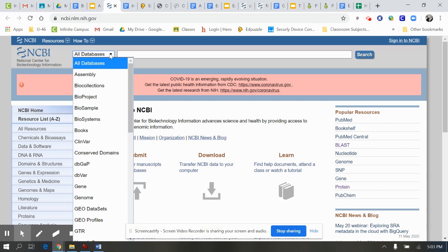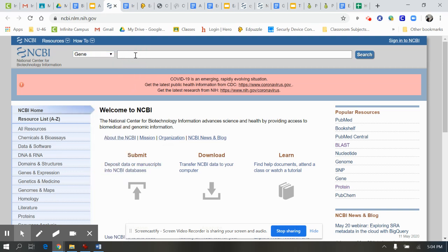And here is where you have to start clicking very specific things. In the instruction, it says use the database. It says gene. It tells you to type in cytochrome C plus your animal name. And again, scientific name works great. I can use my common name because I know what I'm looking for. But when I was searching some of your animals, it was a lot of stuff happening. So for instance, the tiger had a tiger mosquito, a tiger eel, and lots of, again, very technical things. So I want you to get there in the simplest way possible. So I'm going to now paste my penguin scientific name, and I'm going to search it up.